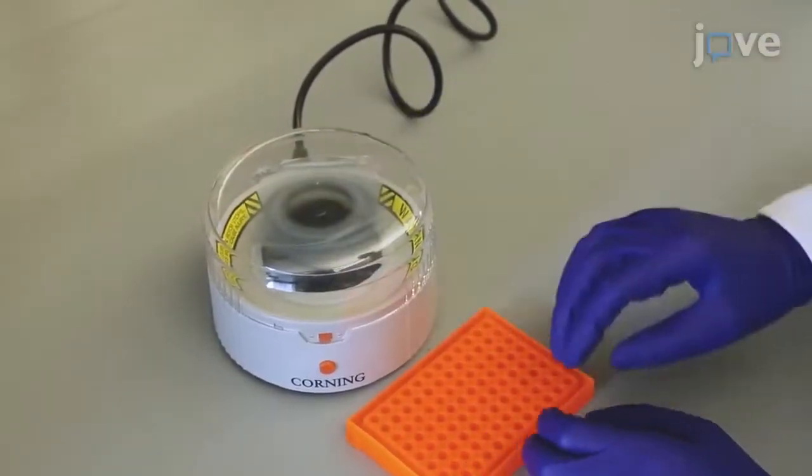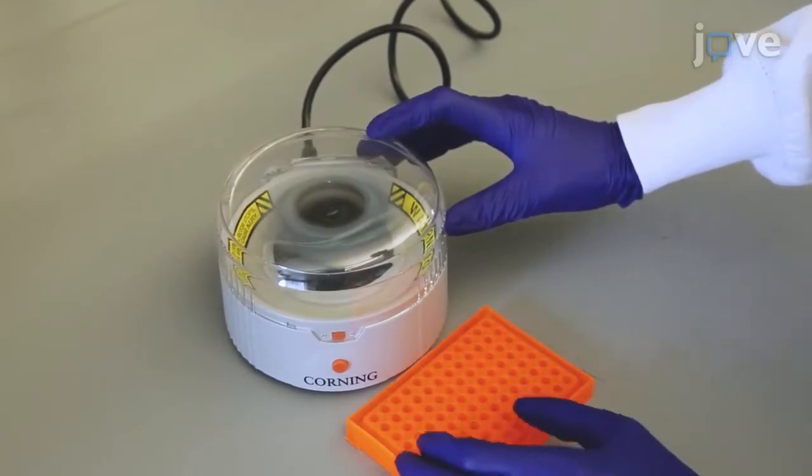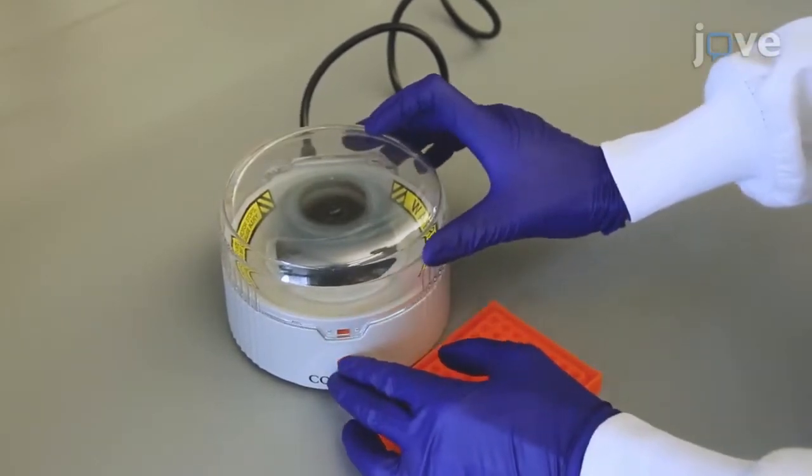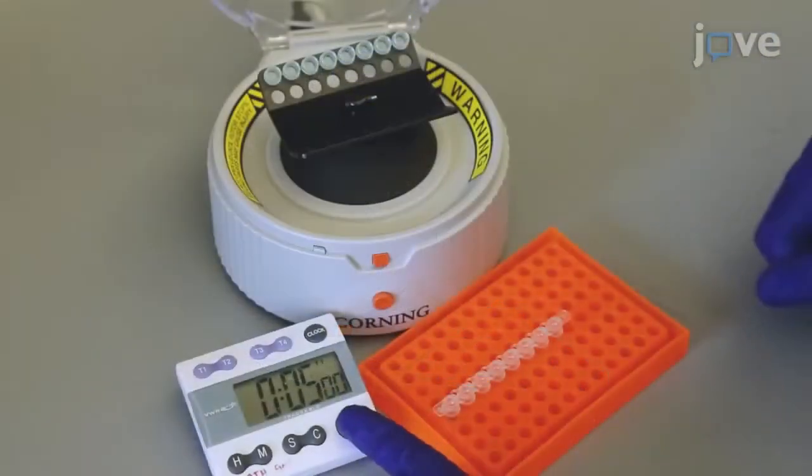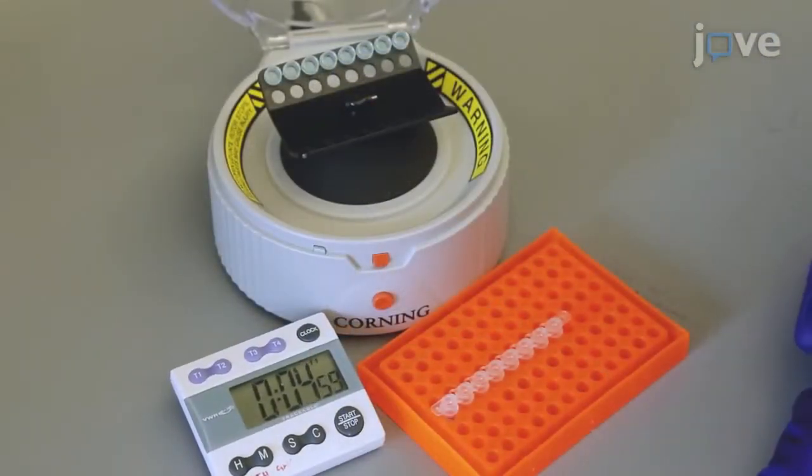Next, spin down the guide RNA oligonucleotide mixtures at 100 times G for 15 seconds. Incubate the reaction at room temperature for 5 minutes before setting up the ligation.